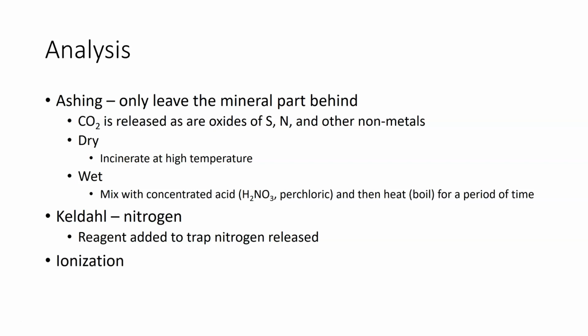Today, one of the major ways we do things is through ionization. In ionization, you can actually take a dry sample, put it into an ionization chamber. It will be bombarded by particles. The particles will cause all of the nutrients to be released. You can tell exactly what's on the inside of it.